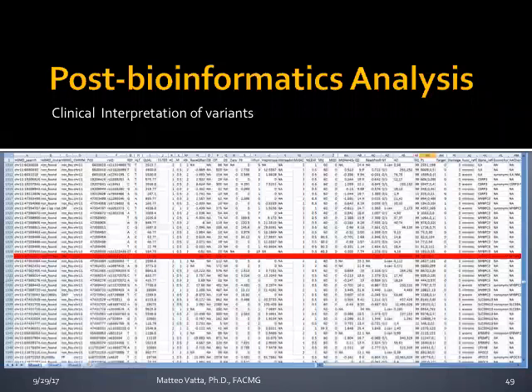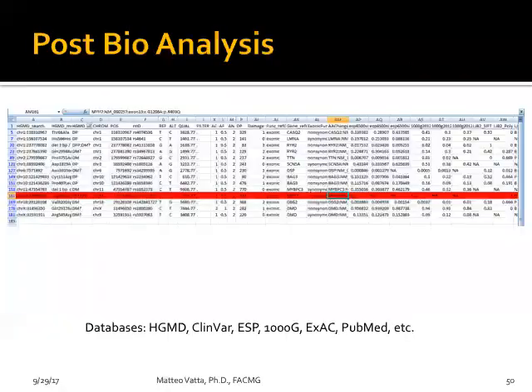Post-bioinformatic analysis, that's what I used to receive in terms of data. Yulong knows it extremely well. I don't know why it doesn't show very well on the screen, it seems to be a low quality image, and I apologize for that. But essentially, what you receive in this case is an Excel file with a large amount of data that you need to analyze. Here it's a little bit better.